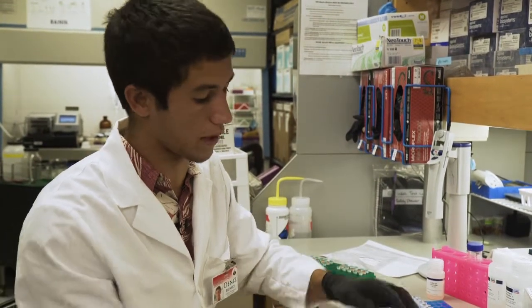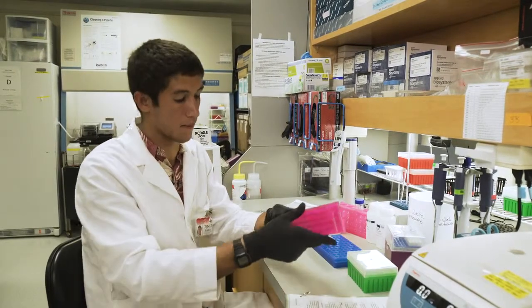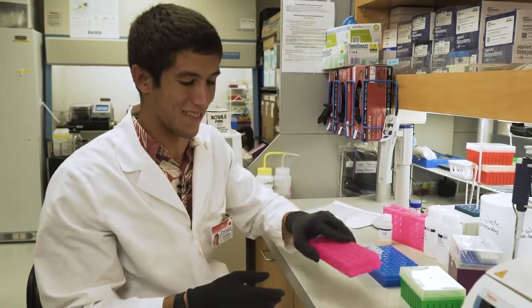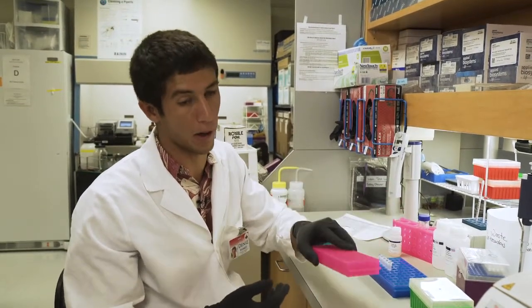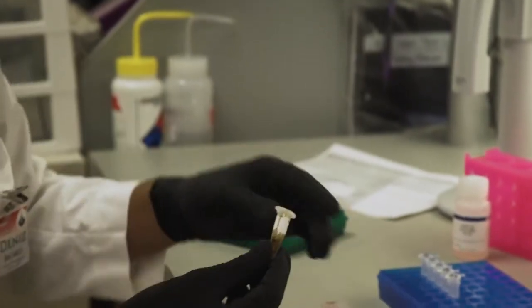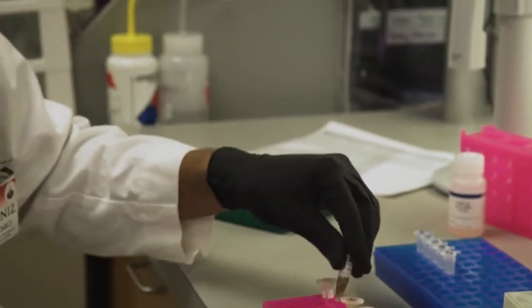Normally I'll have a full rack of these, and it'll be more than just 5. So you'll put your hand on the whole thing and flip it slowly and then flip it back, inverting it 3 times over a 10-minute period while the buffer, the lysis buffer, does its digestion process. It depends on the tissue type and what we're digesting. For this, it's slug tissue and a couple different types of slug.